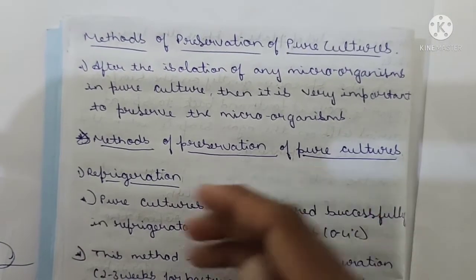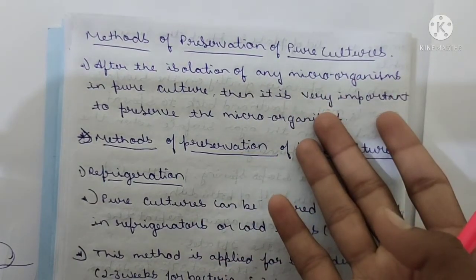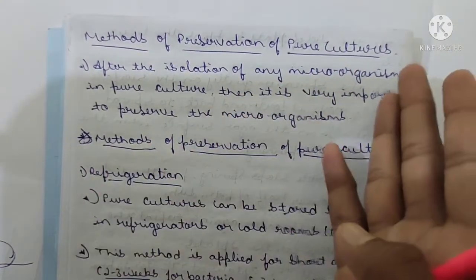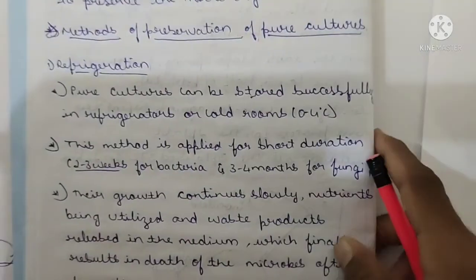Now let's understand methods of preservation of the pure culture. How to preserve that pure culture? Yes, now we have already prepared the pure culture. Now how to preserve it? Simple. After the separation of any microorganisms in a pure culture, it is very important to preserve the microorganisms. Some methods are there for preserving.